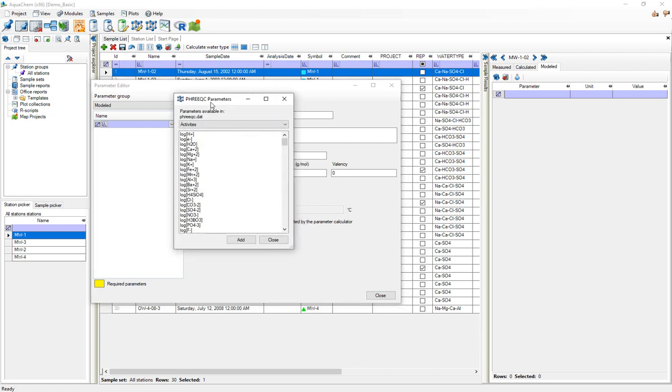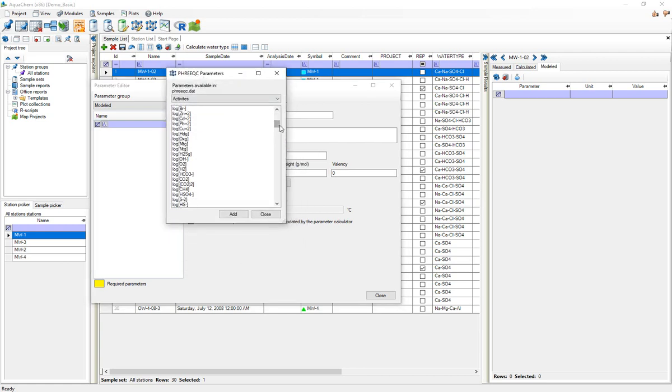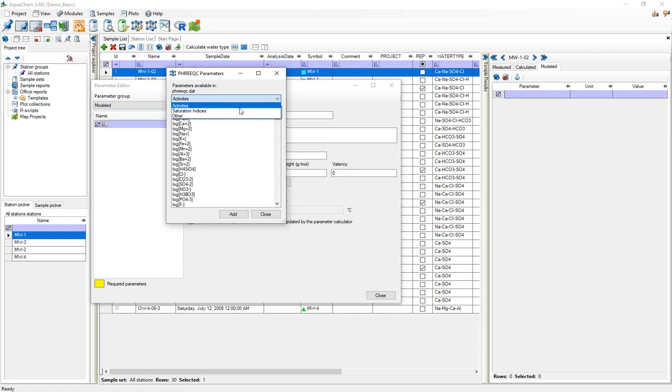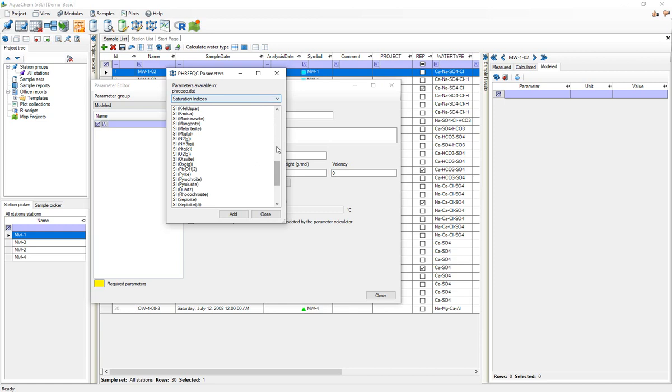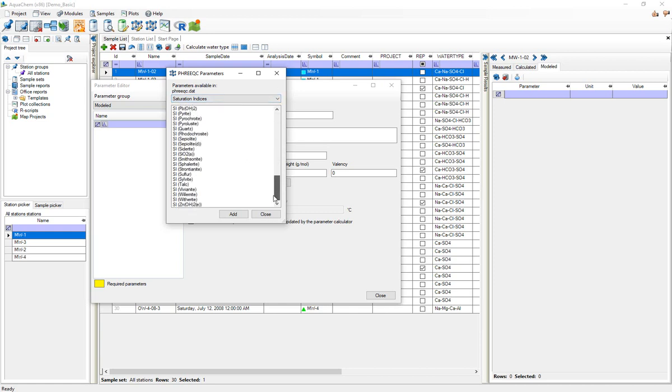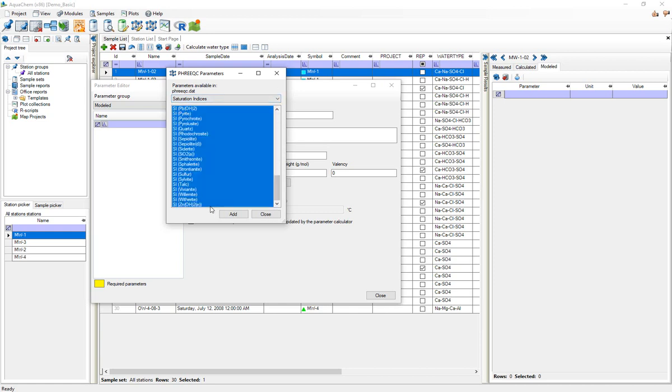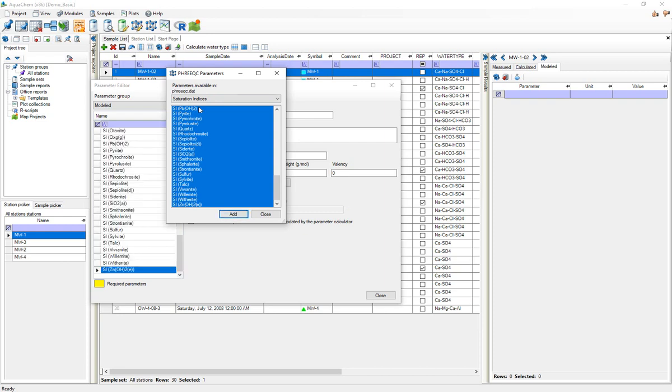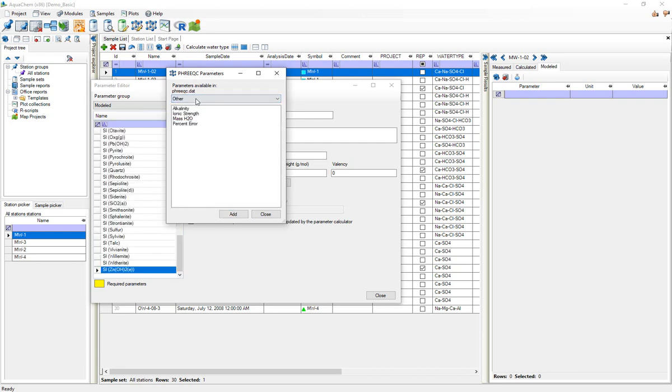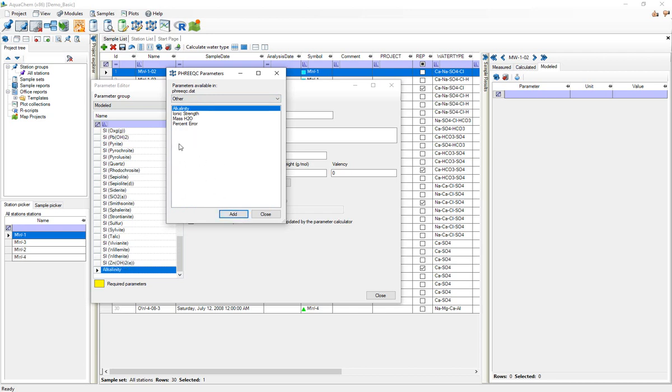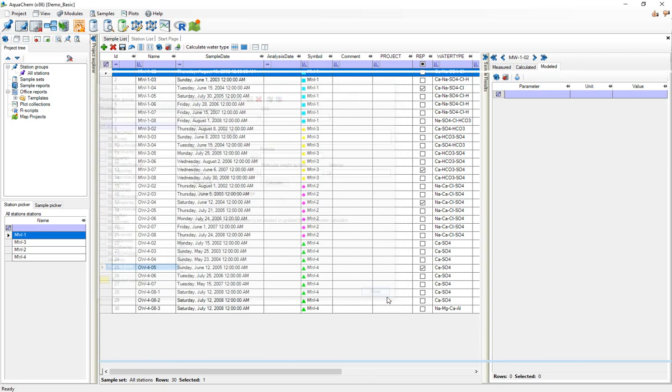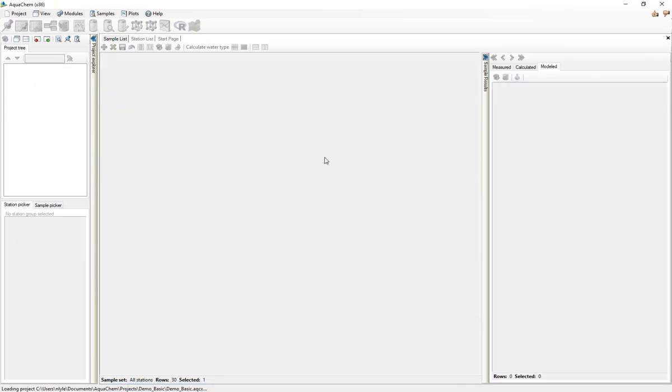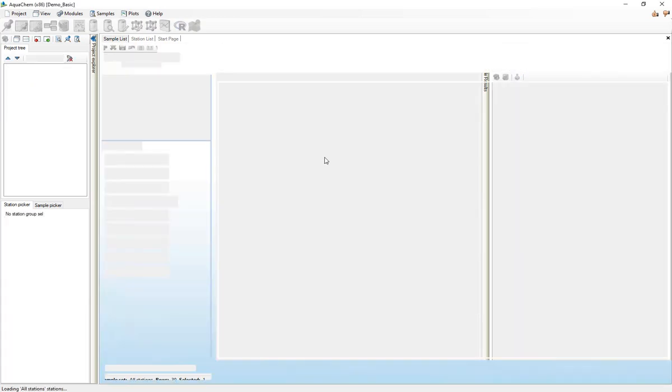If you press it you can see that you got all these options for the different activities, saturation indices and so on. For this project I think I'll leave out the activities and I'll just import all the saturation indices, and I'll also import these other parameters. In fact I'll just import alkalinity and percent error and now I'll click close. The project will reload.